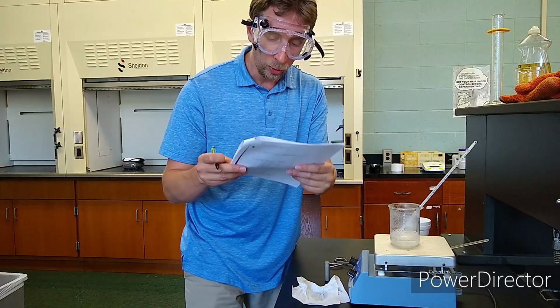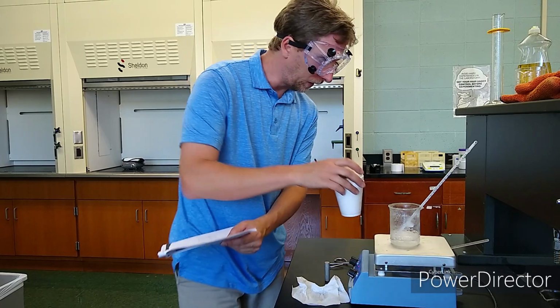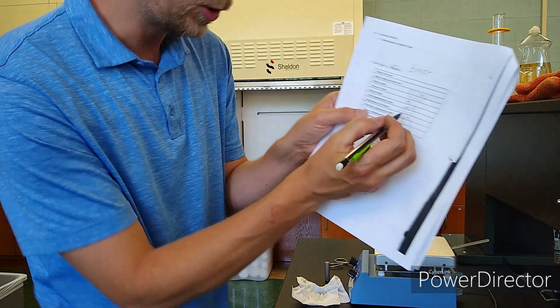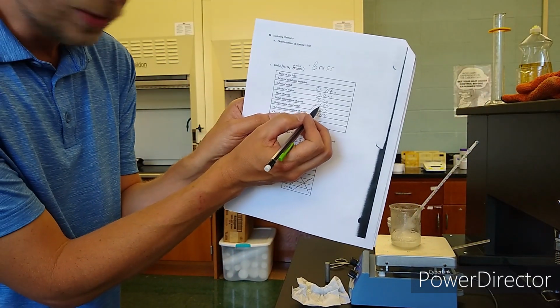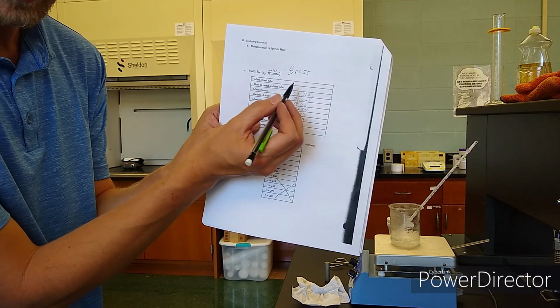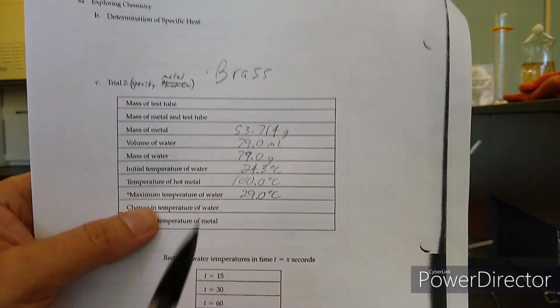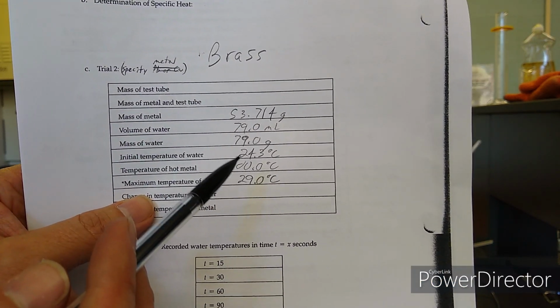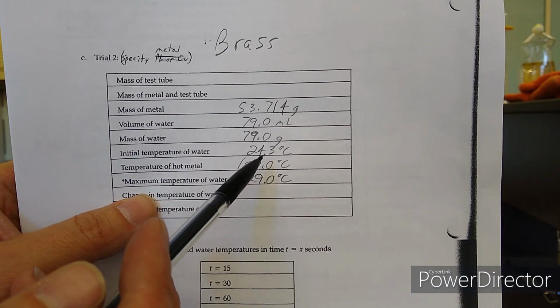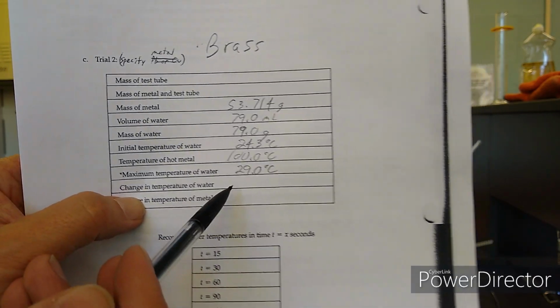What is the temperature change inside the calorimeter when we had that heat trapped very nicely and we're measuring the temperature very carefully. So that's going to be from the initial temperature of the water, 24.3, up to 29 degrees Celsius for this second example of brass. Okay, you guys see that? So it goes from 24.3 up to 29 degrees Celsius. So that temperature change is, what is that, 4.7 degrees for the temperature change of water.